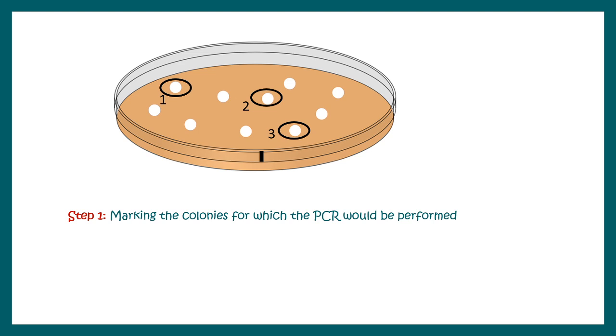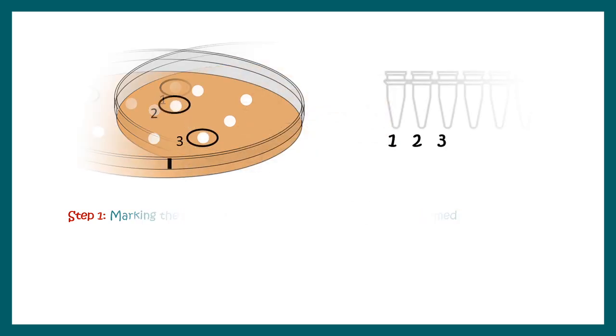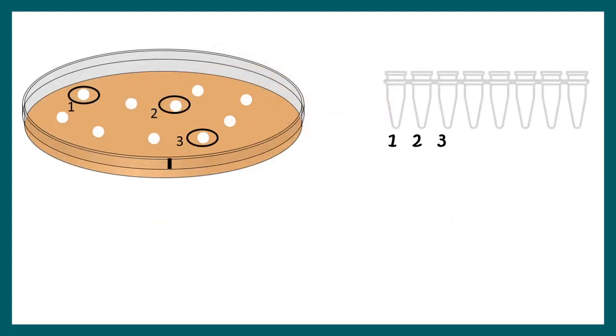For simplicity, we are only picking up three colonies to understand whether the recombinant construct is there or not. We would first scrape out a little portion of these colonies with the help of a sterilized pipette and put it in PCR strips. We would do the same for colony number two and three as well.